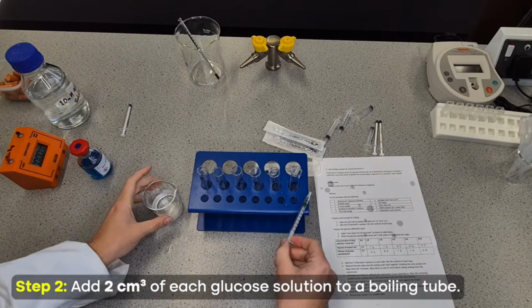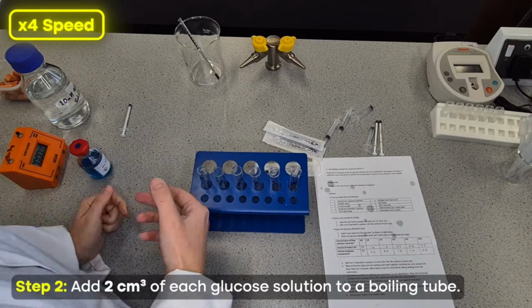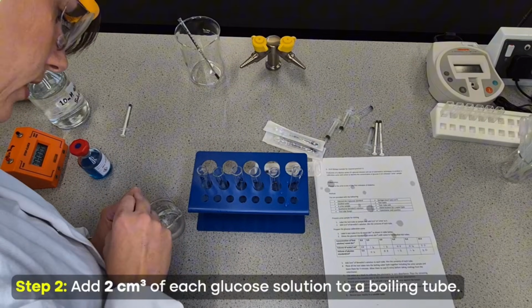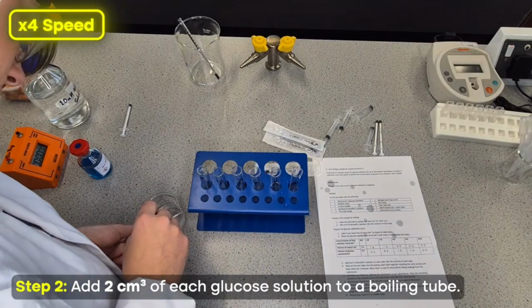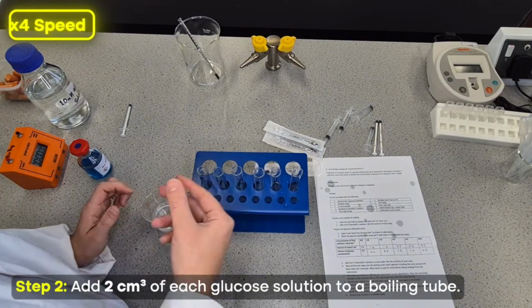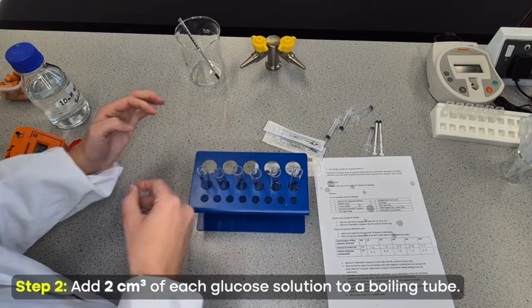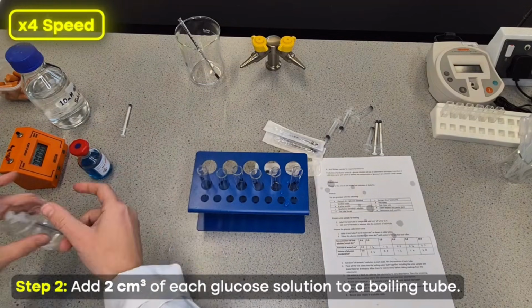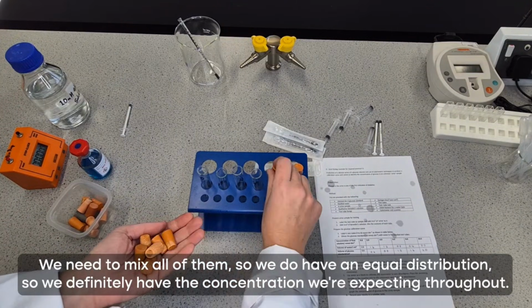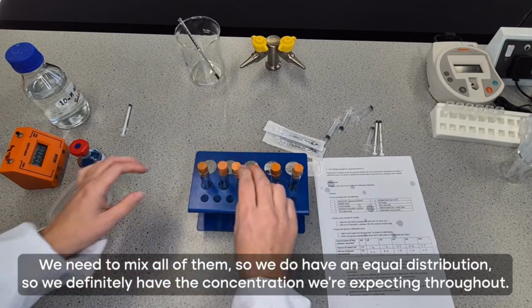Get a new syringe. So this one here is 2 of glucose. The next 1.6 and 1.2, and this one will be 0.8 and then 0.4. I'm then going to get a bung to put on top because we need to mix all of them so that we do have an equal distribution, so we definitely have the concentration we're expecting throughout.